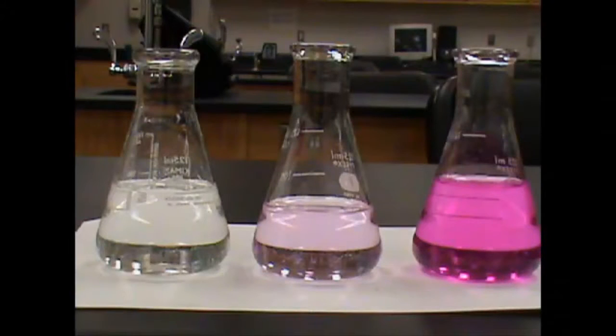The flask on the left has not changed color yet. The flask in the middle is the light pink you will be trying to get, which is called the endpoint. The flask on the right is one drop beyond the endpoint. This means you have to titrate slowly and carefully.